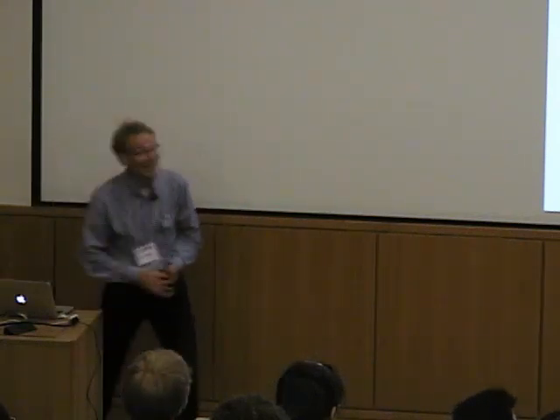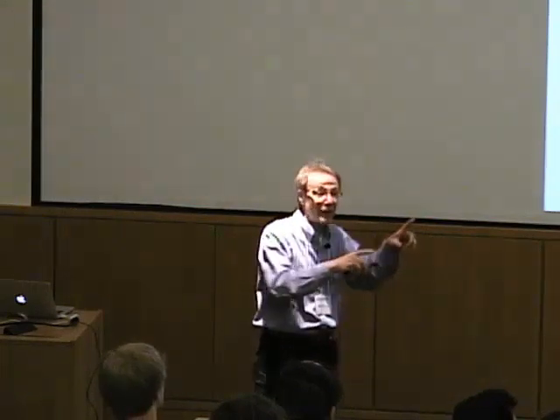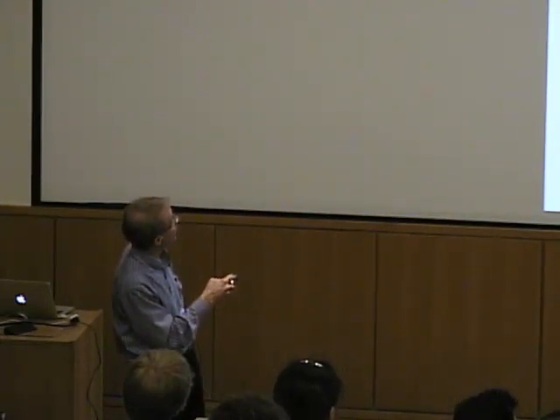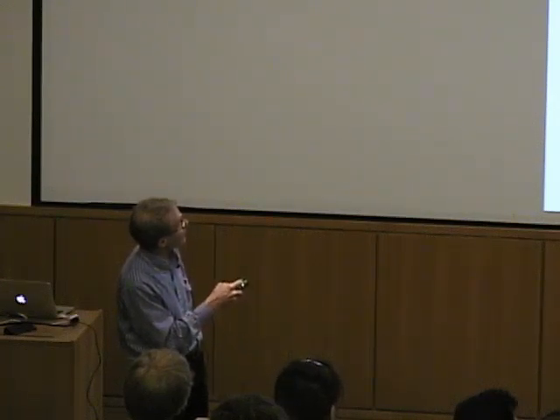Okay, so now taking that, we can do our thermodynamic analysis, the Hess's law analysis, pull out the enthalpies. We measure the binding constant. We know the stability constant with the buffer. We can subtract off that. And so we can end up with data for copper-2 binding to azurin. Here it is in 4 different buffers. And here's the log K value. Pretty tight binding, I would say.